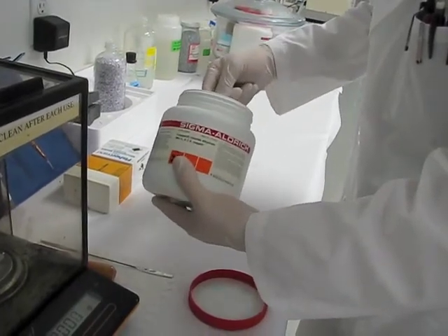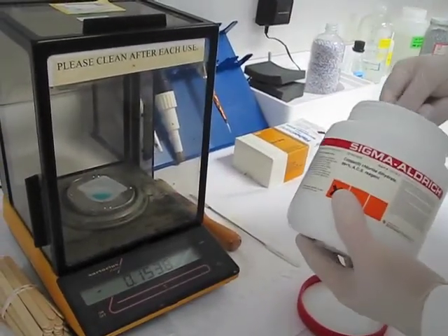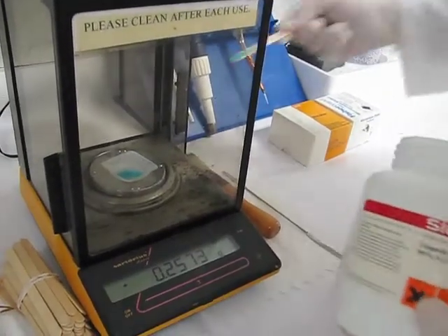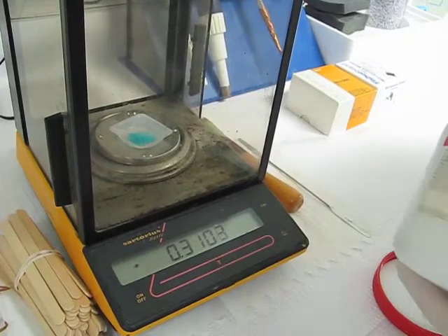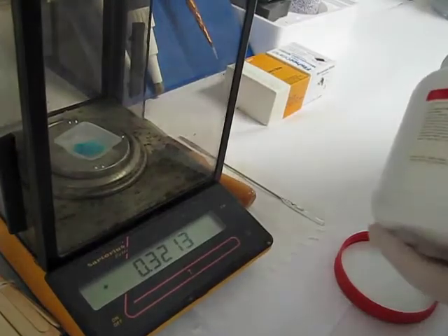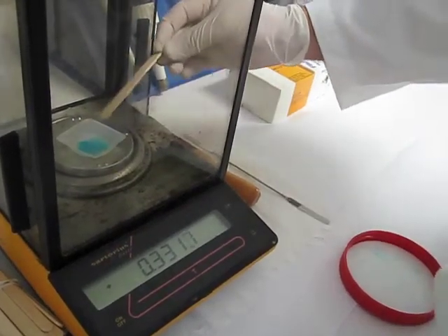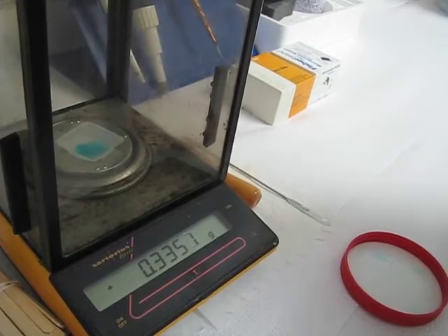Let me just take a little bit here. So that's .15 ... .25 ... .29 ... .31 ... .32 ... and we're at .336 grams. That's close enough, because we're working to three significant figures. Let's close this.